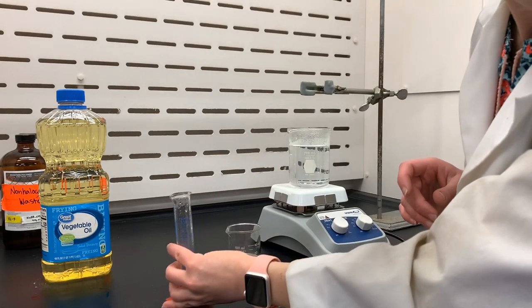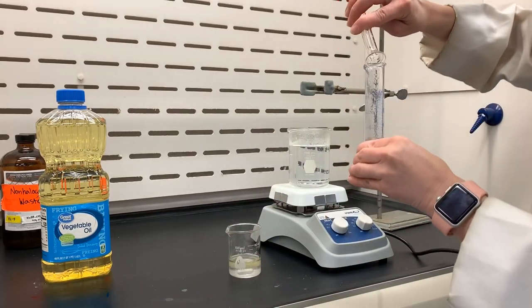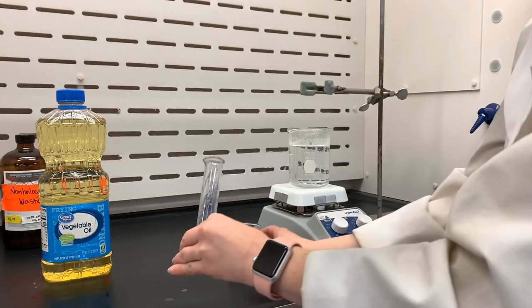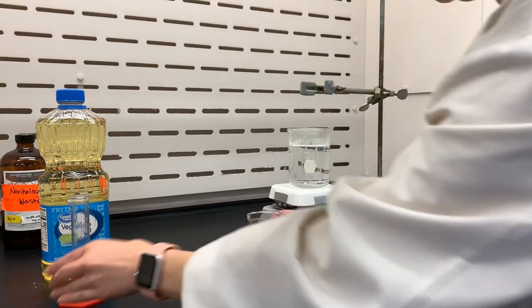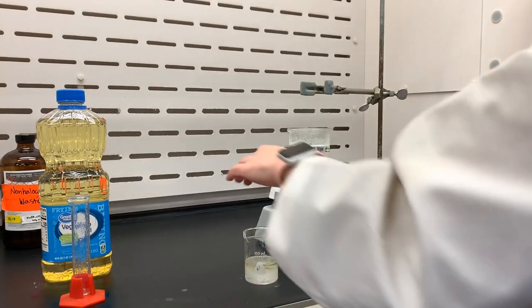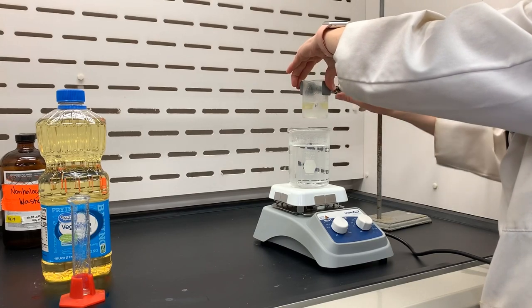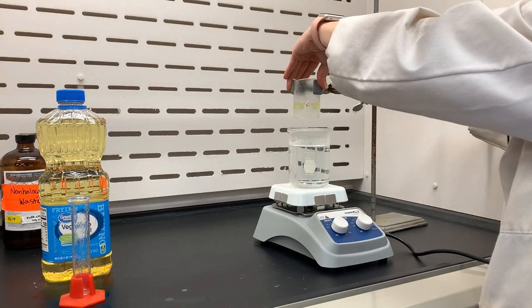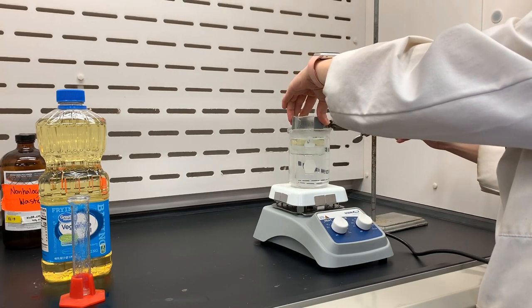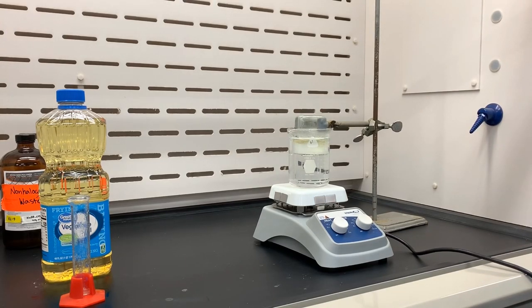And then ethanol. I used ethanol to rinse the graduated cylinder as well. Once all of that is poured into the beaker, the beaker can then be put into the hot water bath where the level of the reaction liquid is just at or below the hot water to make sure that it's fully heating. And you want it to be stirring too, to make sure that the two layers can be mixed together while the reaction is proceeding.